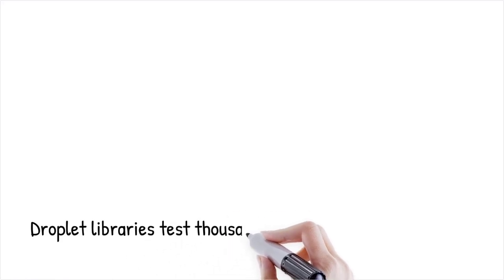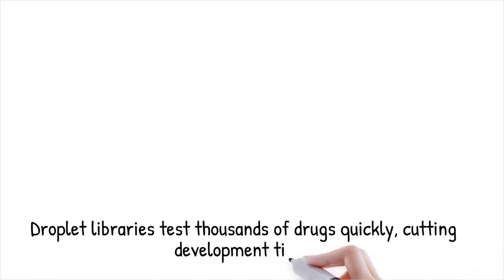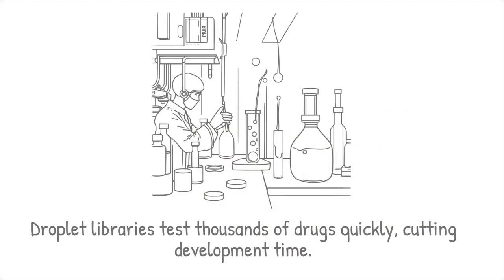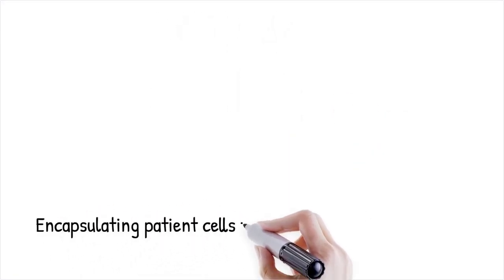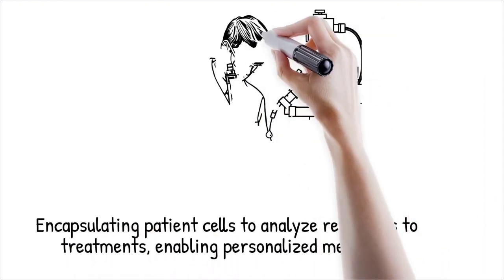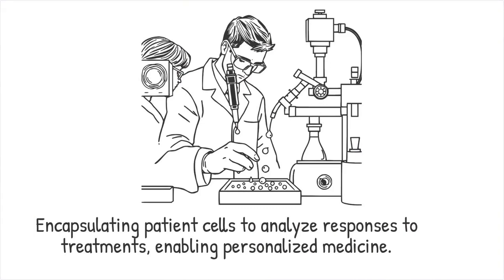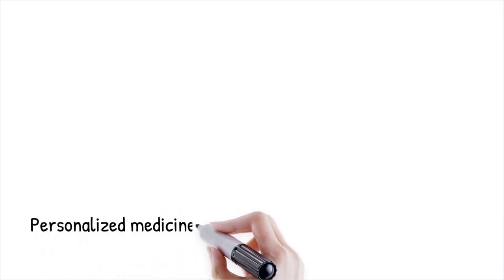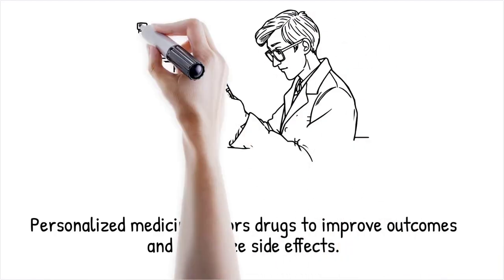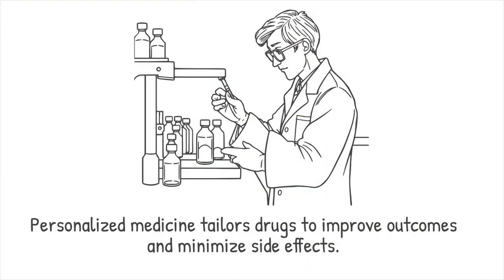Droplet libraries enable the rapid testing of thousands of drug candidates, reducing time and cost in pharmaceutical development. By encapsulating patient-specific cells in droplets, researchers can analyze how individual patients respond to different treatments. This personalized medicine approach ensures tailored drug formulations, improving treatment outcomes while minimizing side effects.